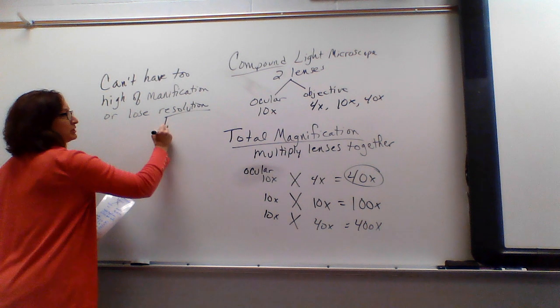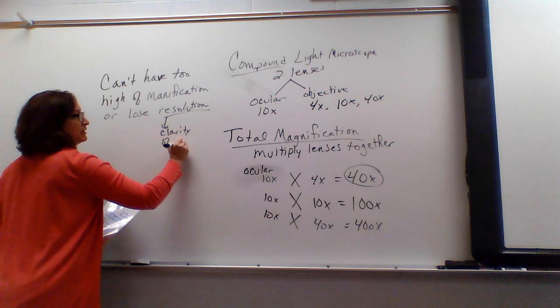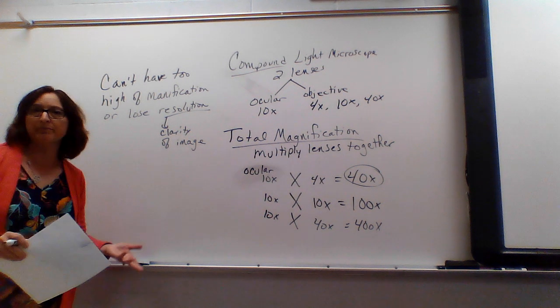And resolution is the clarity of the image. How clear is the image? Okay, so you can't have it too magnified or it won't be in focus anymore.